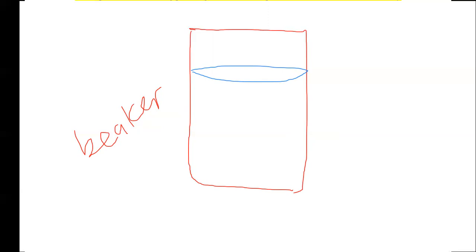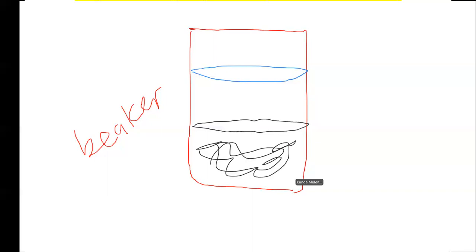I'm trying to undo. Oh no, now I've undone everything. Okay, where's the black line? Where are you? Black line, where are you? Oh, there it is. Yeah, so in case we have the solvent here, and then also I'm trying to explain the partition coefficient, then we have another solvent here.